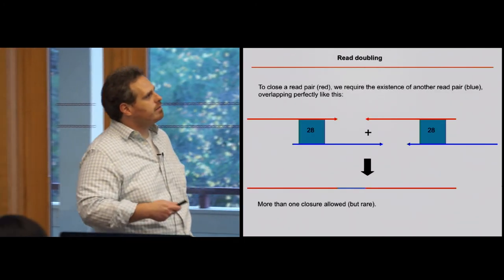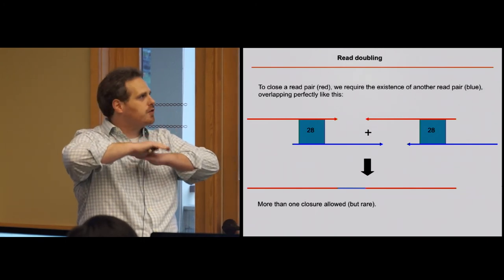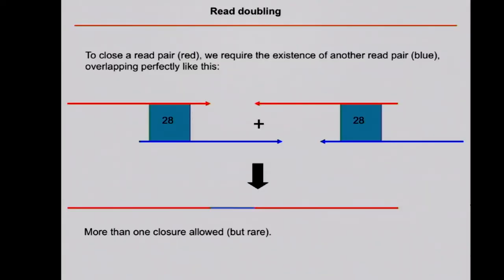Again, the one major requirement is we're going to take these reads that partially overlap and try to pre-merge them together. It's also going to look at other reads to make sure this merge is reliable. If you don't want to use ALLPATHS for this, there are some standalone tools that will do exactly this operation. The one that I recommend is called FLASH, out of Steven Salzberg's group. I wasn't part of it, but I know how it works really well. It does a really good job. That can be very effective for not only genome sequencing, but transcriptome sequencing and structural variation analysis. Just getting longer reads is really helpful for all these different assays.